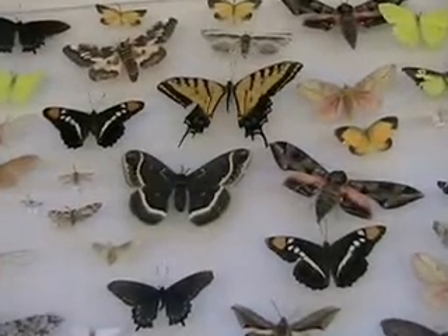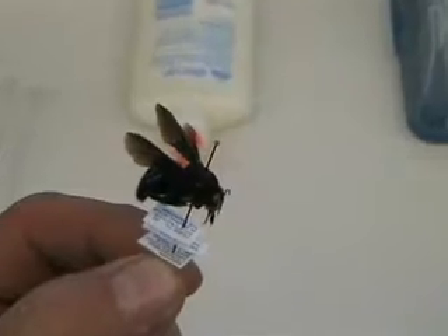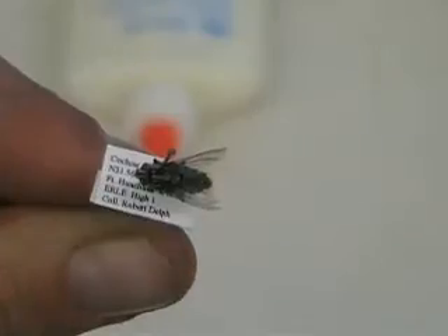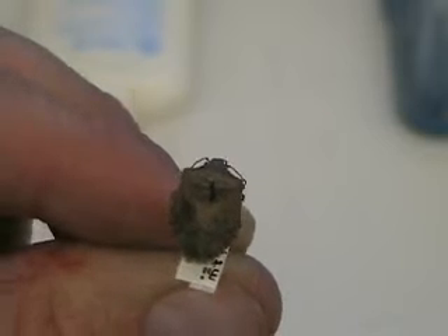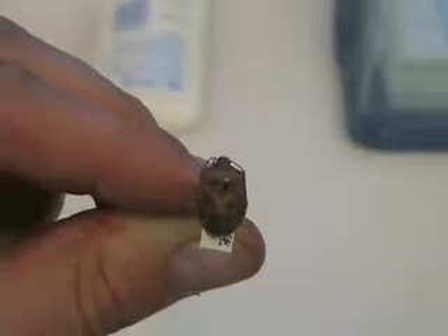Larger insects are usually pinned right through the center of the thorax. Things like bees and flies would get pinned through the center of the thorax. With hemipterans — true bugs — you're pinning them through the scutellum, which is a little triangular region on the thorax.